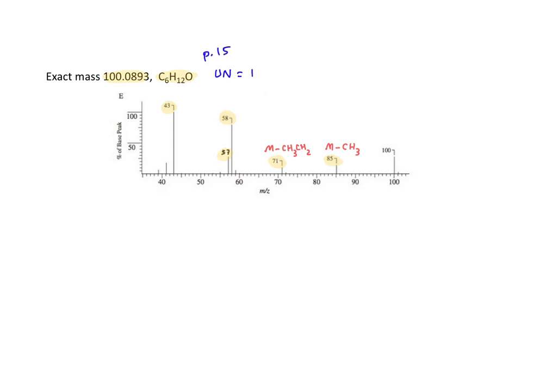The mass spectrum provides considerable structural information, but I do not believe that we can make a claim for only one structure. The McLafferty rearrangement, along with a single oxygen and an unsaturation number of 1, suggests that this compound is either a ketone or an aldehyde.